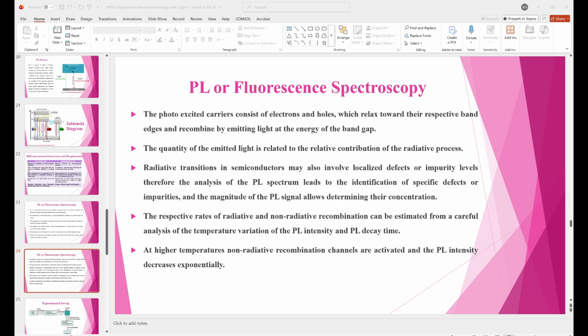So the transmitted light will interfere with your lambda emission. That is why the detector is placed at 90 degree, because transmitted light is negligible in this direction. It's almost not there. So that is why the detector is at 90 degree for fluorescence spectroscopy.